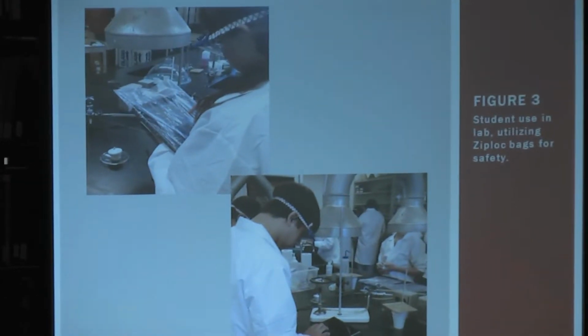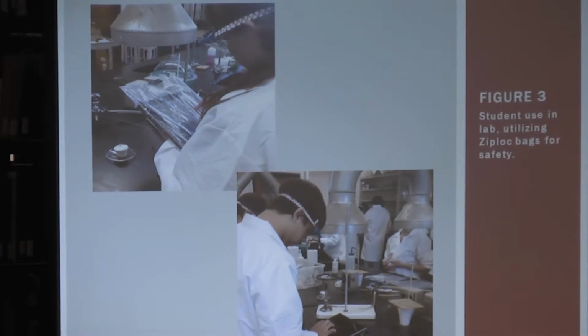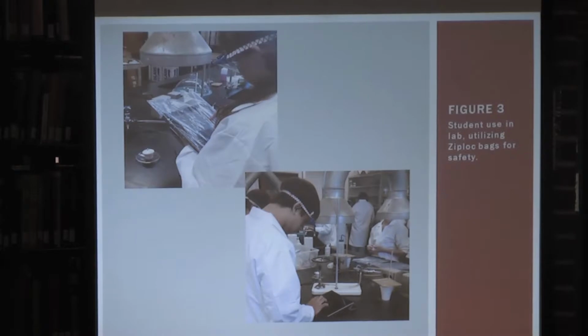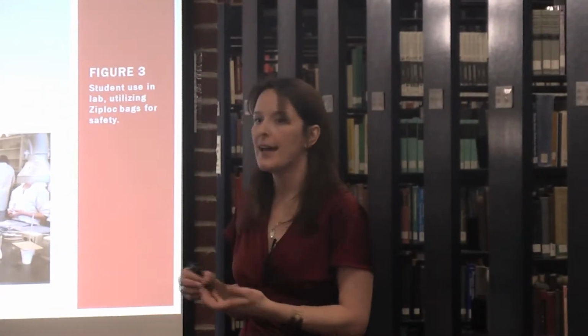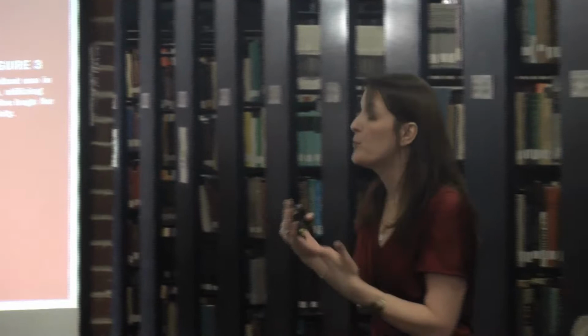This is a couple of the students in the lab working with them, and I stuck this in there because I wanted to point out the fact that we had the students take the iPads and put them in Ziploc bags when they were in the lab. And we actually found that in one of the papers that we were looking through when we were looking for research on this. One of the medical schools recommended doing this. When they're in the Ziploc bag, they're still sensitive to your touch, so they still work, mostly. They still work when you put them in the Ziploc bags.